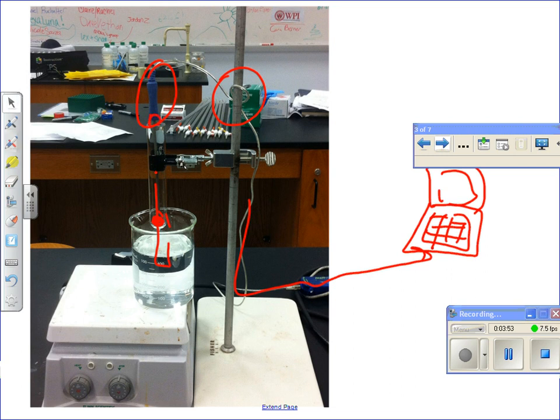When you go to set it up on a laptop, all you're going to do is hook it up to the same thing that we did Hess's Law last time. You're just going to open it up, click Create Experiment on the computer, and then you're going to have time on the bottom, temperature, and then you're going to click on this once you liquefy it, when you start to cool it. So if it liquefies, you pull the test tube out of the water, that's when you click Start. So you click Start on the computer once you pull the test tube above the hot water bath. And then it's going to time and it'll track the data.